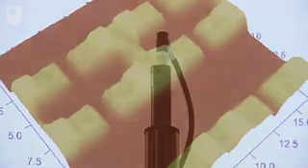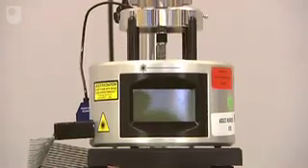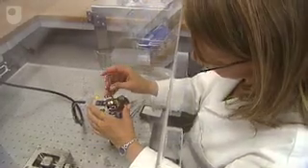The AFM is one type of scanning probe technique that is particularly useful, as it can be used to image a large range of surfaces. It can be applied across many disciplines including engineering, material science, physics, chemistry and biology.